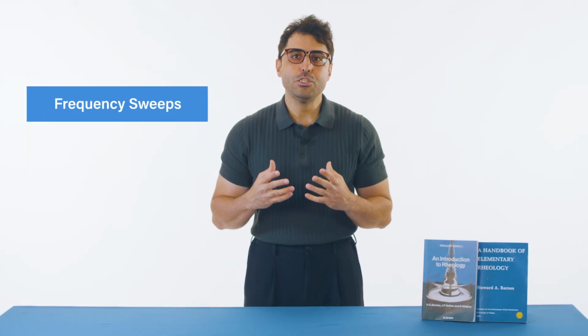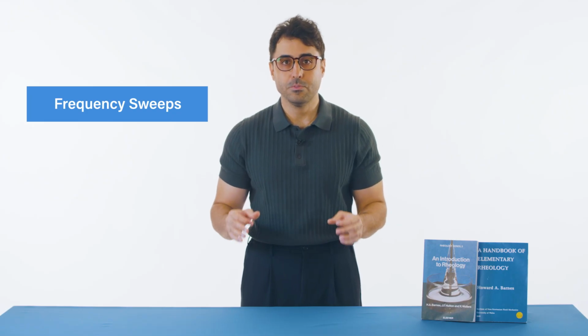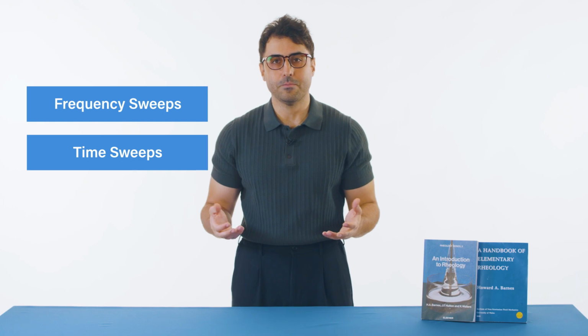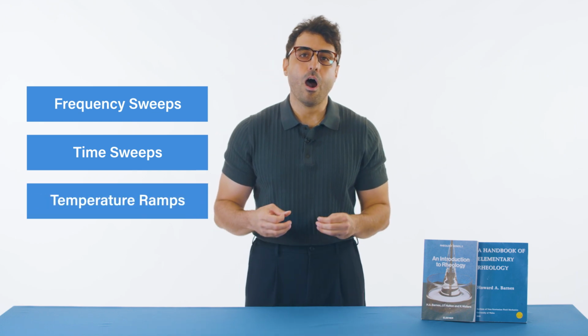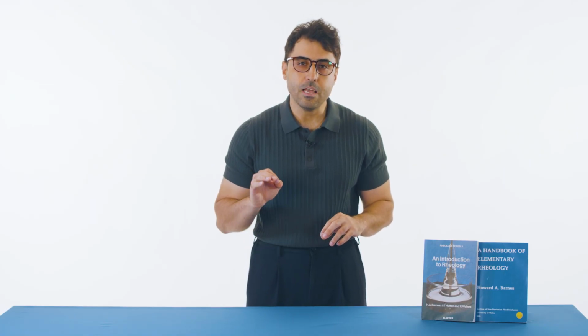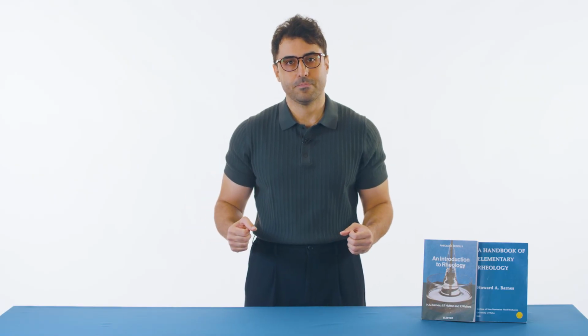So to summarize, frequency sweeps show how materials respond at different time scales. Time sweeps reveal how materials change over time, and temperature ramps uncover thermal transitions and stability. Each test gives us a different lens into the material's behavior, and together they help us build a complete picture.